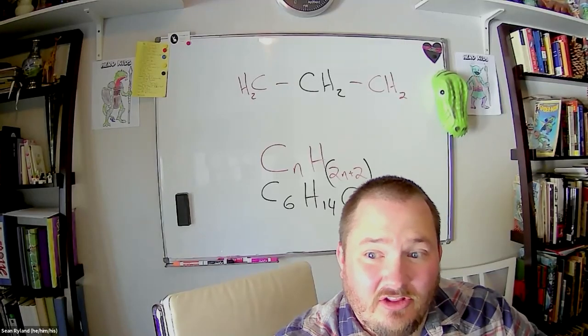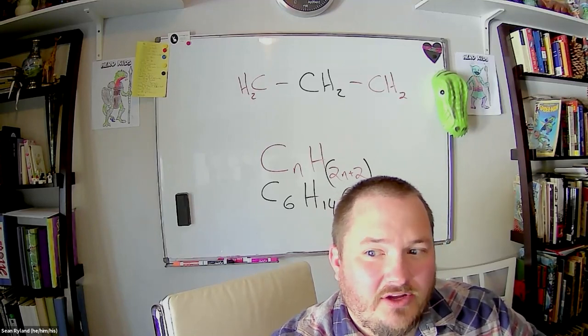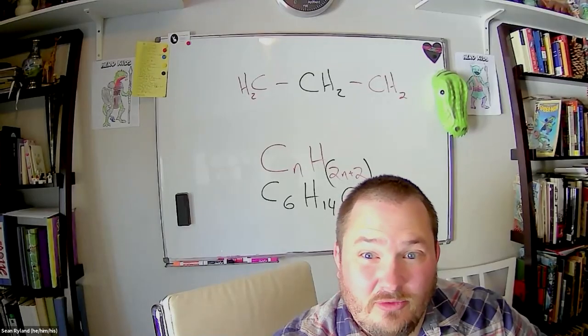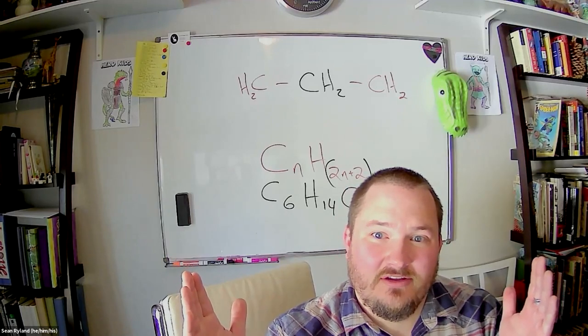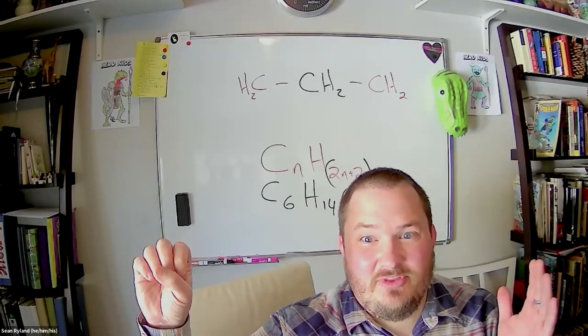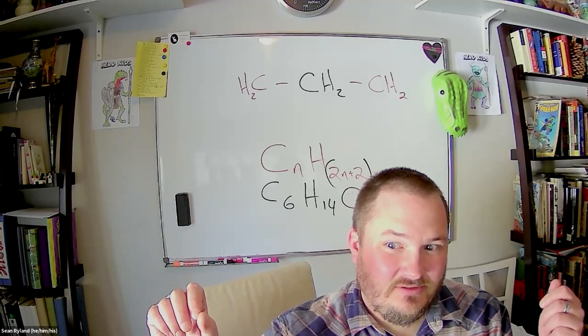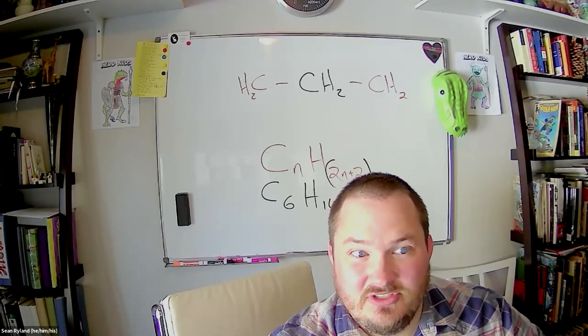When I was looking at the, what's that? A hint? This is good. I like hearing you guys work it out together. You only have one carbon that has an integration of three. So likely only one methyl group? You have to have two ends of a carbon chain, right? Right. So on one end, you could have a CH3, but then on the other end of the carbon group, you've got to have something else attached. So a primary alcohol would kind of fit the bill on that one, wouldn't it? It would, yeah. And then that accounts for all of the twos that you see in there.